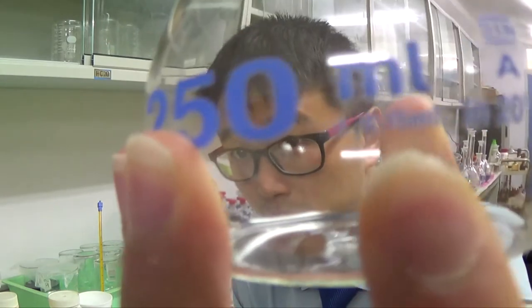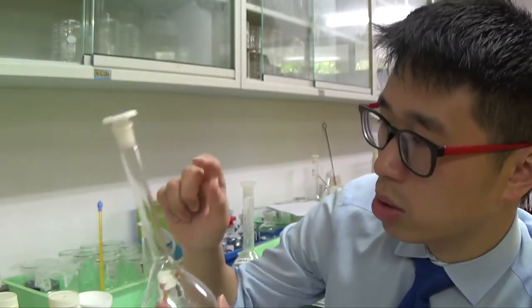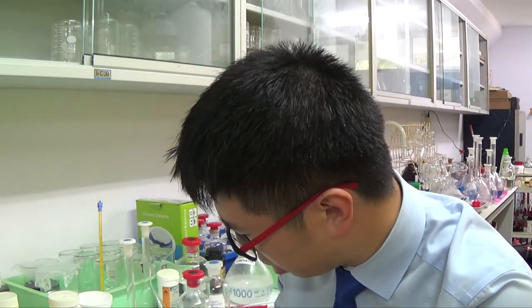Even though the volumetric flask is a pretty accurate apparatus with its own error accuracy of plus or minus something, all apparatus has this. To reach the final stock solution you're using other apparatus as well — like the mass balance — and each piece has its own percentage error. This is important not just for alternative-to-practical settings like A-level Paper 4 or IGCSE, but also for experimental planning, design, analysis and evaluation, since there's often a question asking you to make a stock solution from the solid itself.